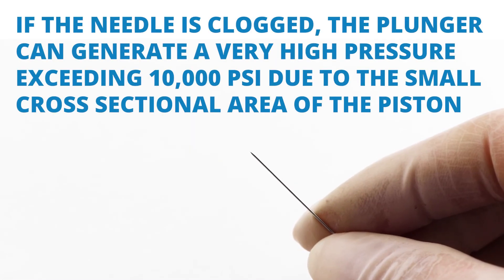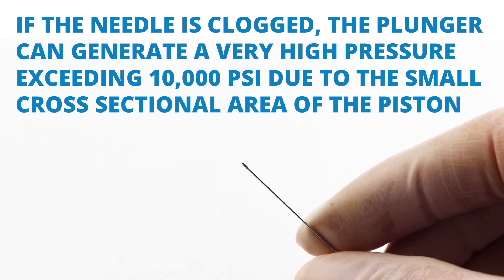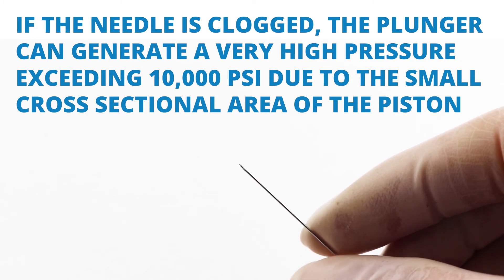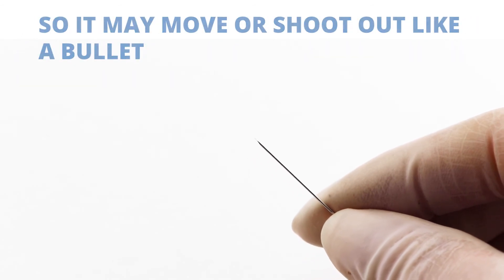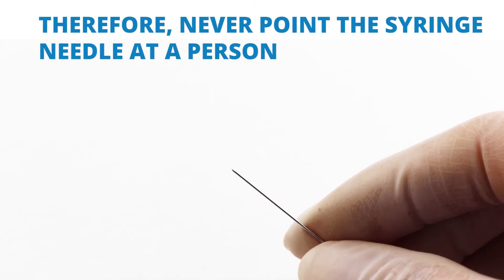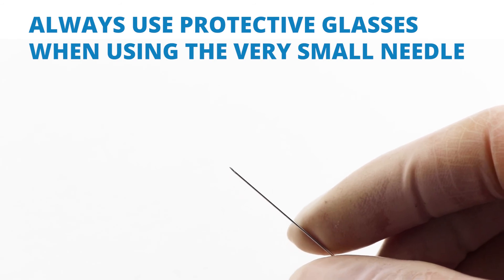If the needle happens to get clogged, the plunger can generate very high pressure exceeding 10,000 PSI due to the small cross-sectional area of the piston. The gasket will not be able to hold the needle in position under such high pressure, and it might move and shoot out like a bullet. Never point the syringe at a person, and always wear protective eyeglasses when using a very small needle.